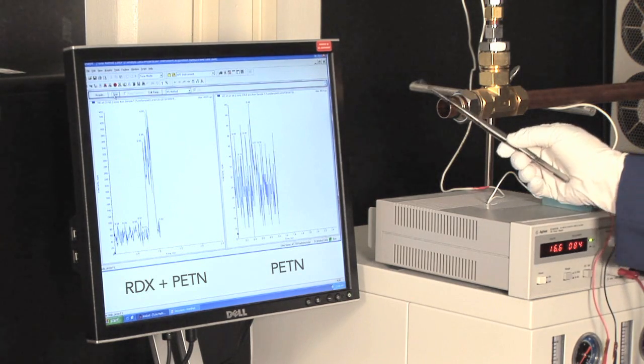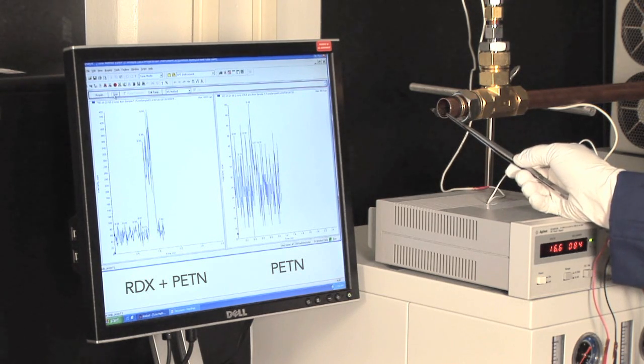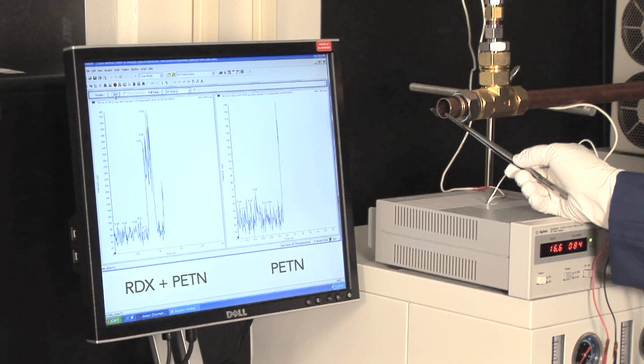This is another glass microscope slide, now with the residue of PETN on the surface. When we sample the vapor from the PETN slide, we see a response for the PETN on the right side of the screen.